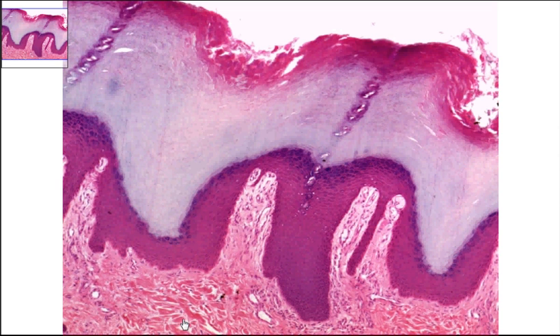So on this slide, we have our complete epidermis and then the more superficial portion of the dermis.